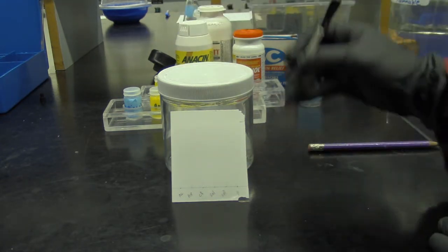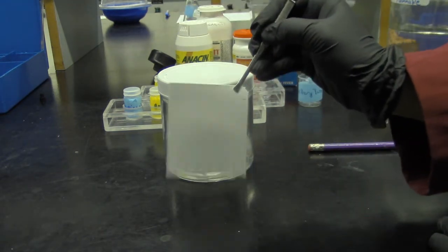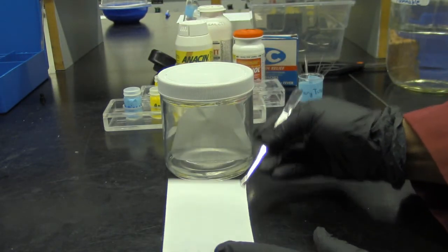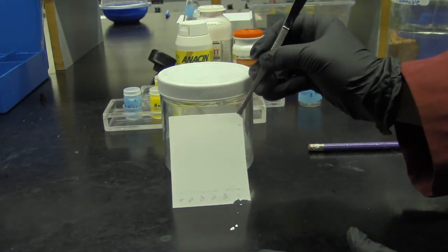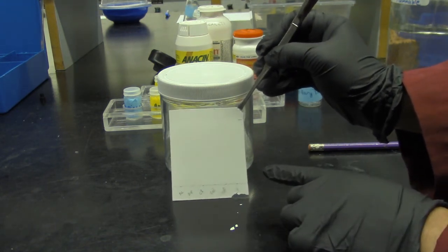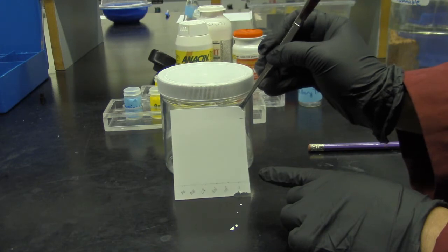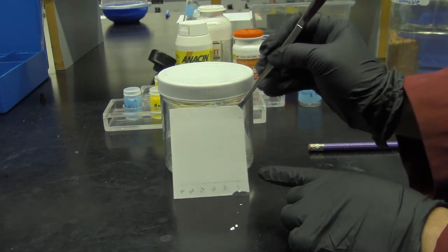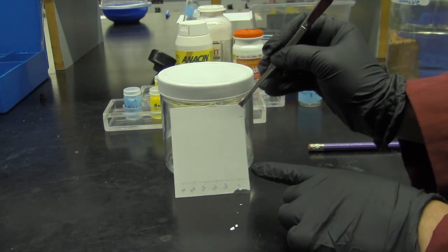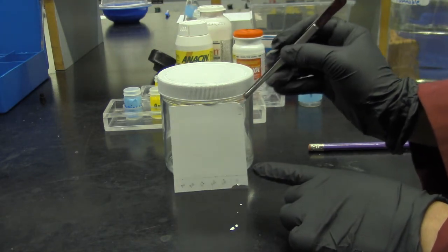Okay, so I'm just gonna shake it and let it dry. And once it's dry, we're going to visualize the plate, visualize the spots using UV light, right? So we're not doing iodine stain. So we're going to use a UV lamp and look at the spots, okay?